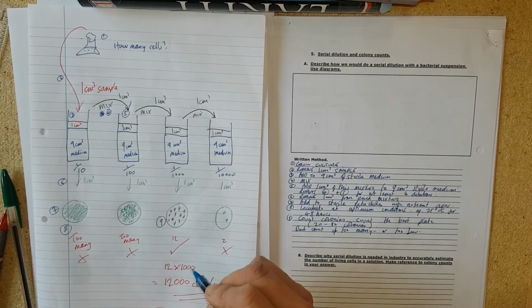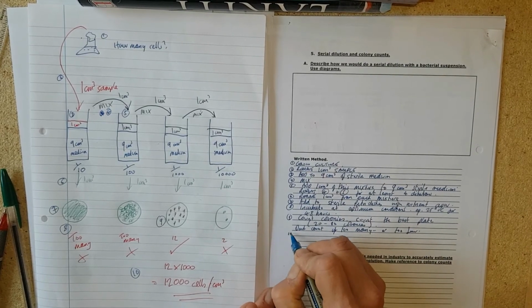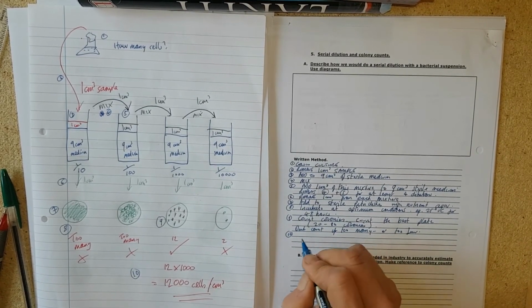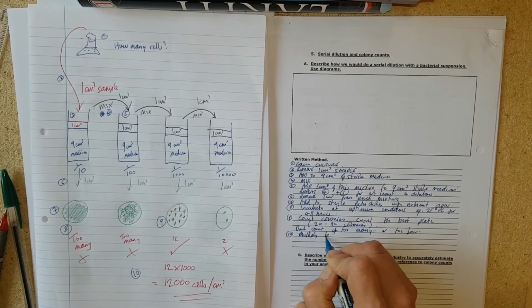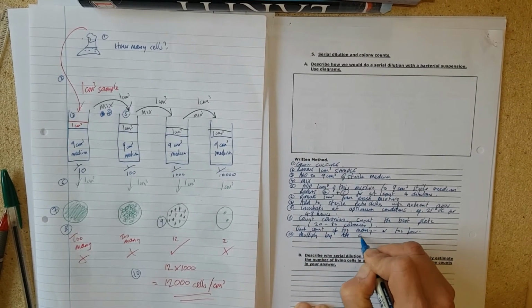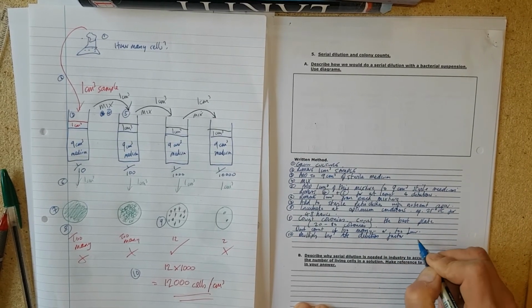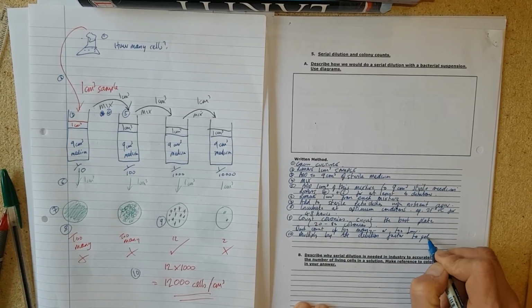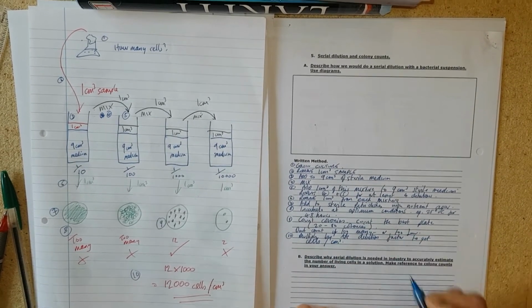And then the last step is step 10, which is multiply by the dilution factor to get cells per cm cubed.